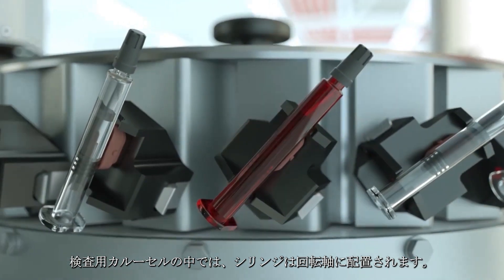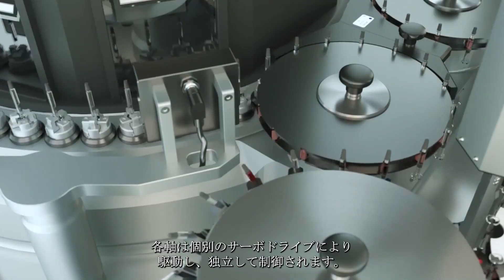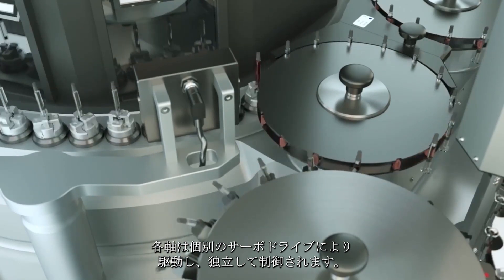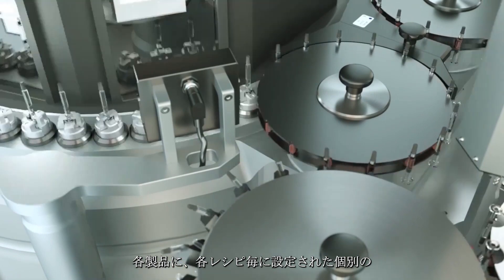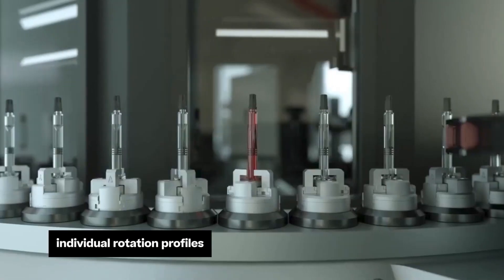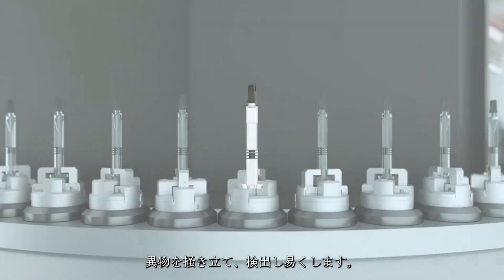Inside the inspection carousel, the syringes are positioned in rotation axes. Each axis is powered by an individual servo drive and controlled independently. An individual rotation profile deposited in a respective recipe can be assigned to each product. The syringes are rotated to stir up and expose possible particles.